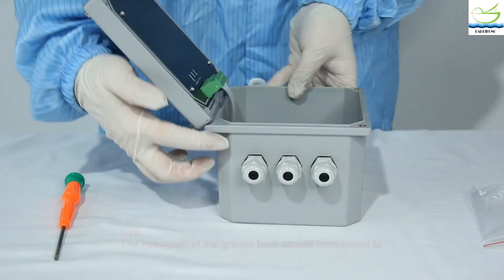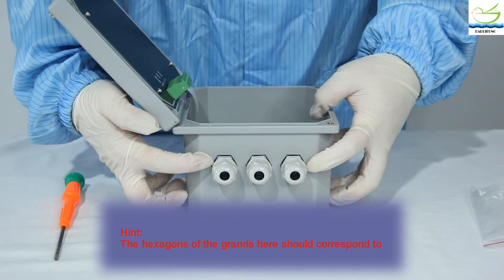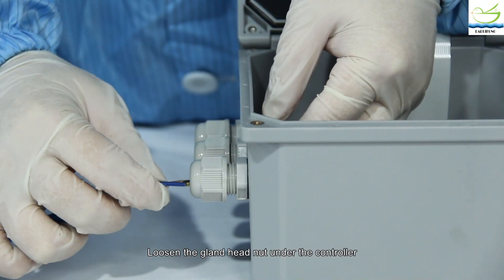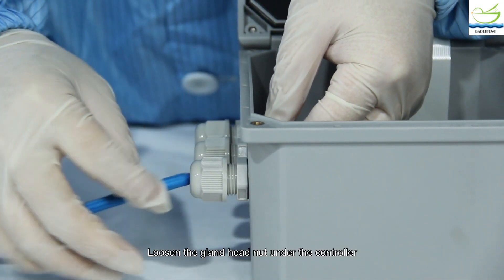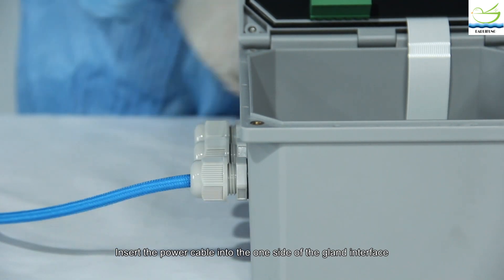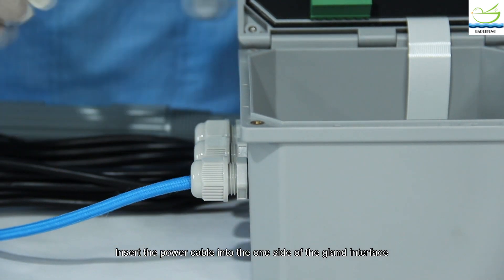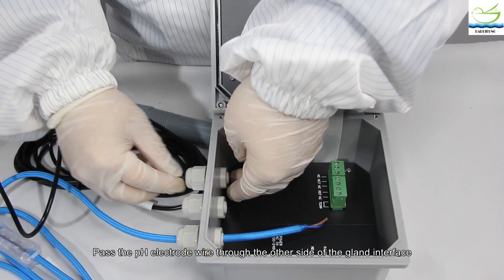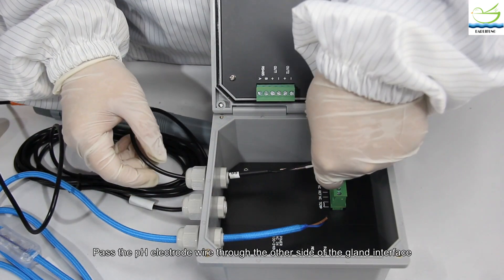Tighten the inner nut of the glands. Loosen the gland head nut under the controller. Insert the power cable into one side of the gland interface. Pass the pH electrode wire through the other side of the gland interface.